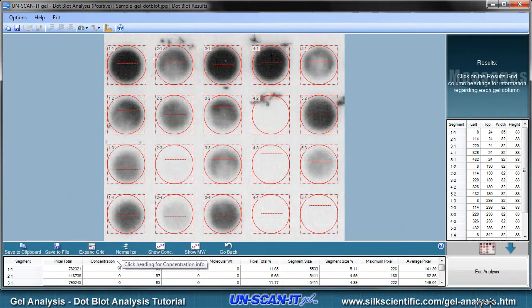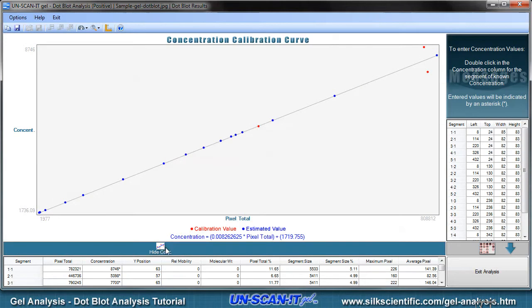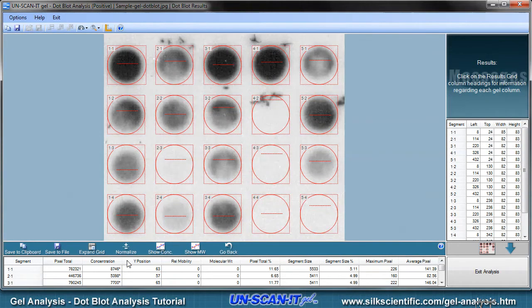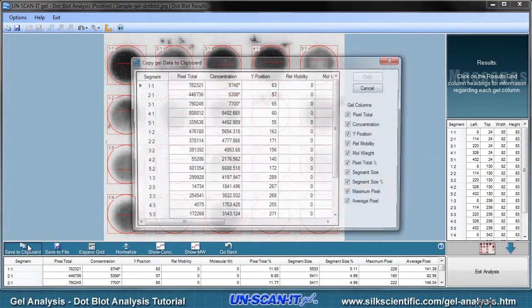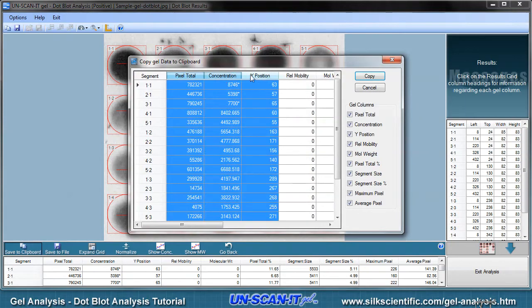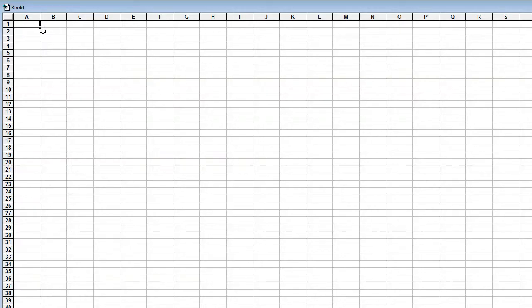You can use the results spreadsheet to create a concentration calibration curve using values from a standard. The analyzed data can be saved to a data file or copied to the clipboard, and then pasted into Excel or any other spreadsheet or data analysis program.